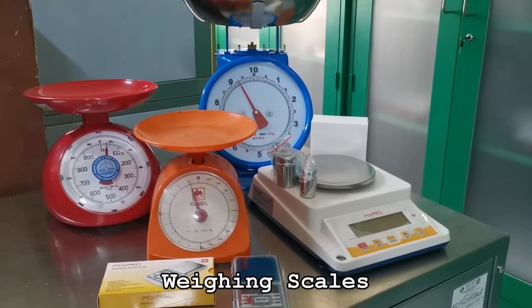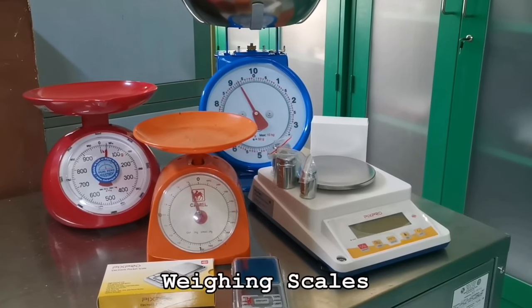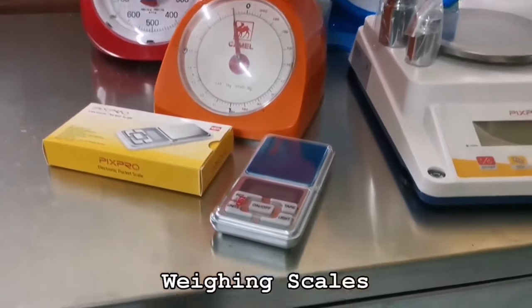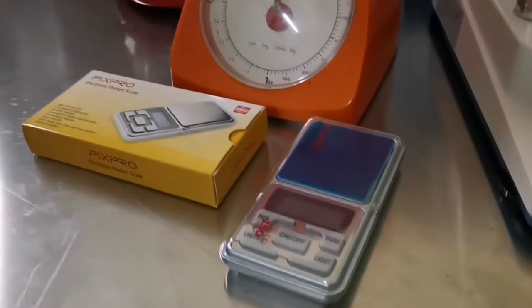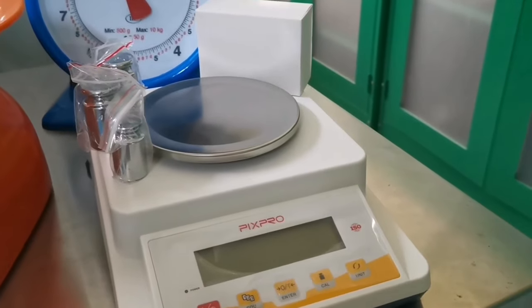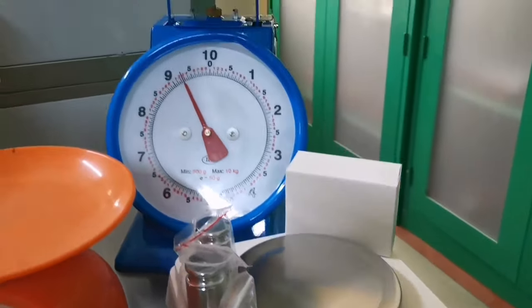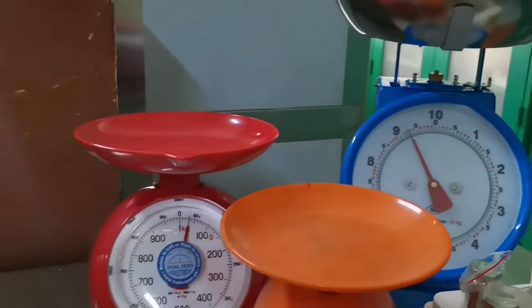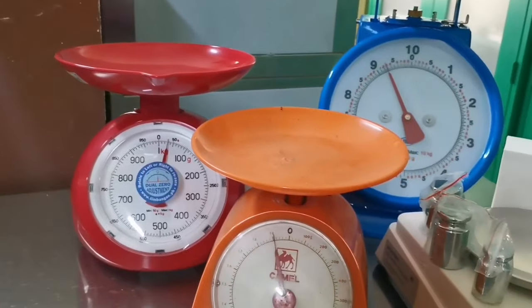In addition, you also need to know how to weigh a variety of chemicals you will use in your lab activity. Weighing scales and balances measure weight by measuring the amount of force exerted on the load cell. They then convert that result to mass and display it in various units.